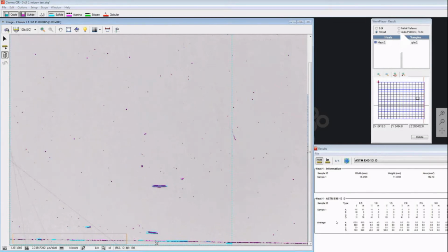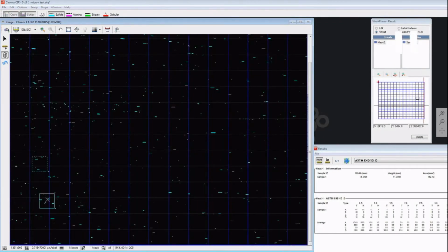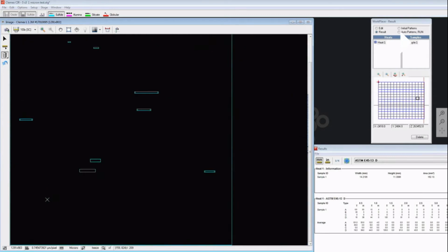So this is part of the work that an operator must do. He must clean his sample. And once it's clean, as you saw, this thin inclusion worst field floating window was here, and it moved here. So it always goes on the worst field. I'm going to be looking now at the heavy inclusion.